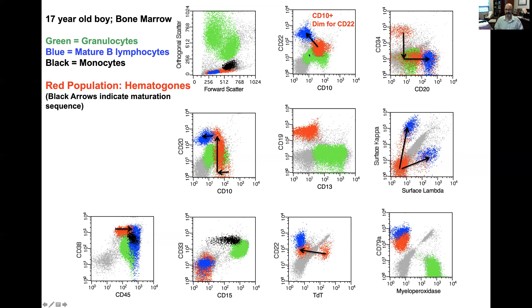Looking at CD22 versus CD10: the defining marker is really a pan B cell marker like CD22 or CD19 co-expressed with CD10. CD10 is also called CALLA — common ALL antigen — and CD10 positivity in the context of an ALL used to be called a CALLA-positive ALL. Hematogones are defined by positivity for CD10, but are DIM for CD22 compared to mature B cells. Their maturation spectrum goes from dim CD22 to bright CD22 as they lose their CD10. When they become CD10 negative, we don't call them hematogones anymore — they basically become mature B cells.